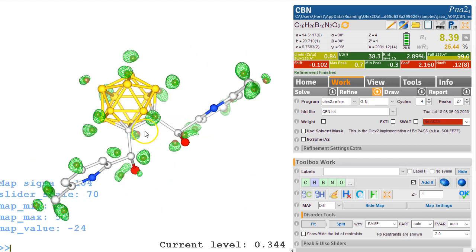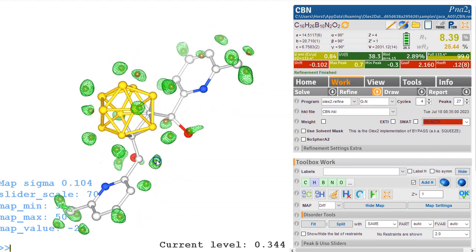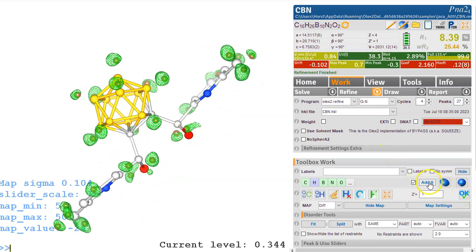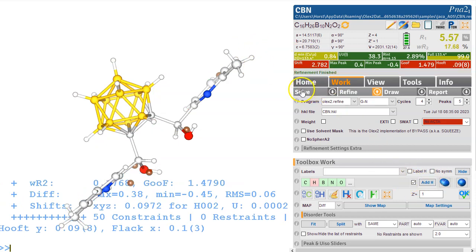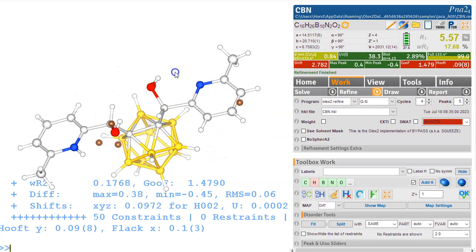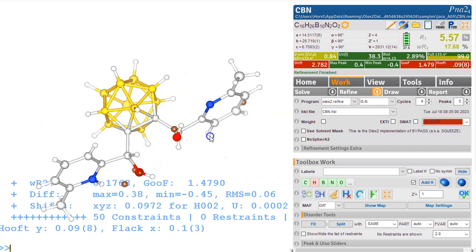Ctrl M should also show quite clearly all these hydrogen atoms that are here. So let's just add them automatically, this box is ticked. So therefore, it will also automatically refine. So now it shows five peaks, that's the default. So when it thinks it's found all the hydrogens, then it will show five.